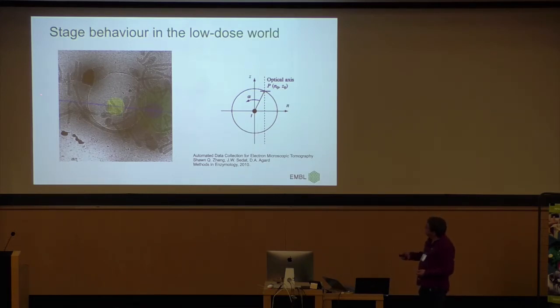The problem is, if your tilt axis is not super duper calibrated, then your focus and tracking area would have a different, they call it N0 here in this paper. So they should be in one line, and if this line is not calibrated properly, I'm a little bit off, and I then start to tilt, they have a completely different behavior. Not just from the shift, but also it's cryo, so they probably also have a height difference, and then these things become completely crazy. So it's very difficult to track these things. You have to be very careful with that.